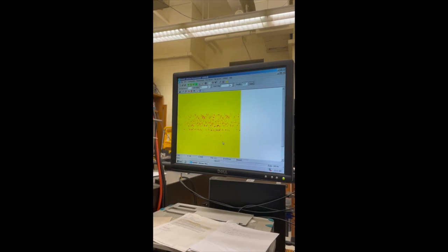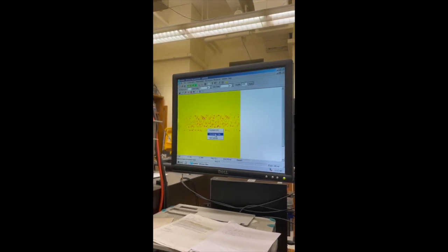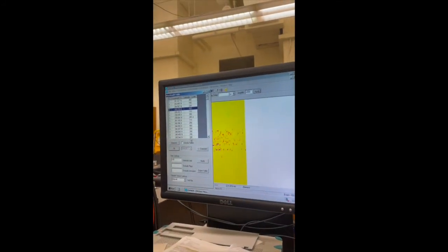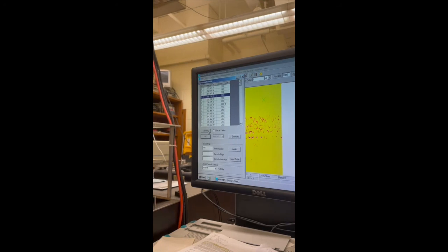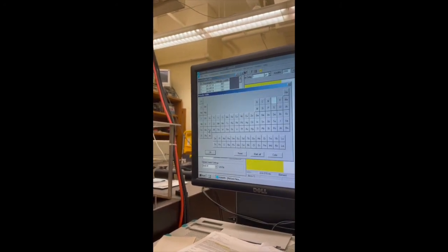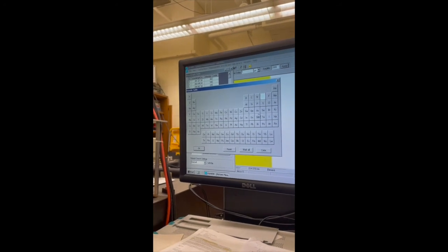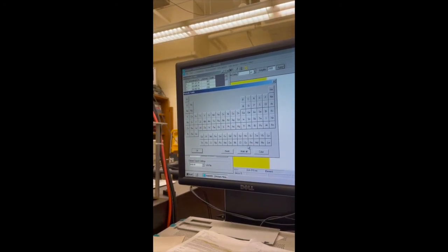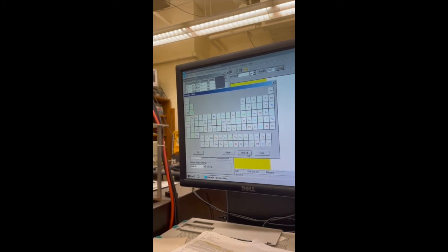agrees with that. So if you right-click anywhere, bring up the wavelength table, what's it set for? Right now it looks like it's reading the oxygen lines. All right, so we're not interested in oxygen, so let's go ahead to the elements. Brings up a periodic table, which you should be familiar with. Let's unclick oxygen, and you can just click on iron if you want. Cool. You could mark them all.